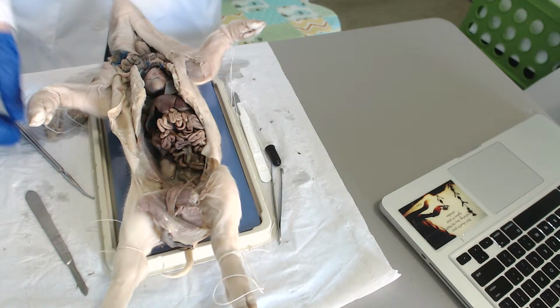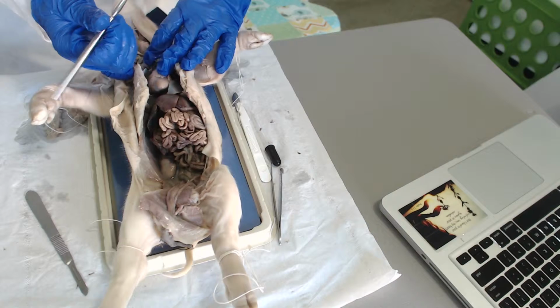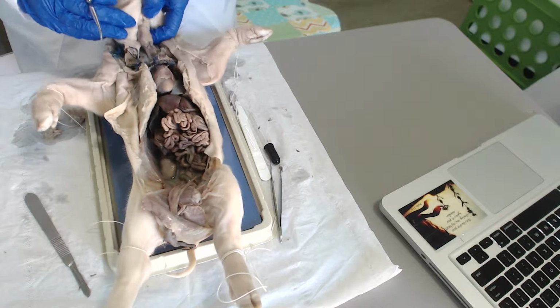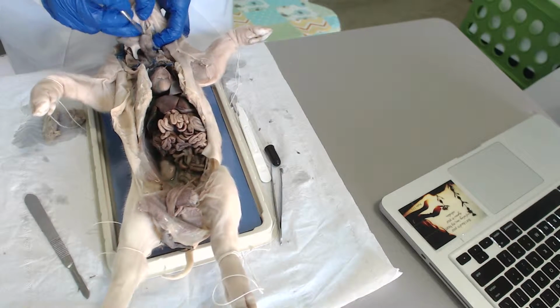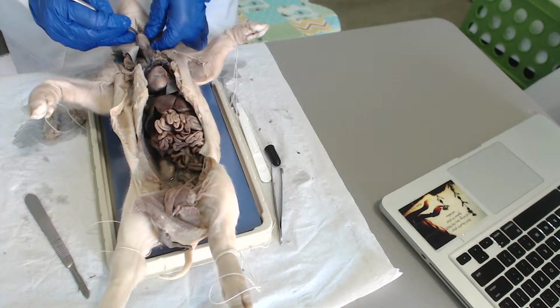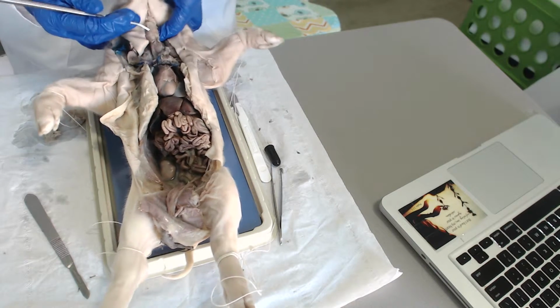Okay, to continue with the dissection, we are going to locate the pharynx and the larynx. And of course the pharynx is going to be at the very upper portion, also the throat area. And then once you pass that, you're going to get into the larynx. And of course we have the larynx, and here's the trachea. You can see the trachea.